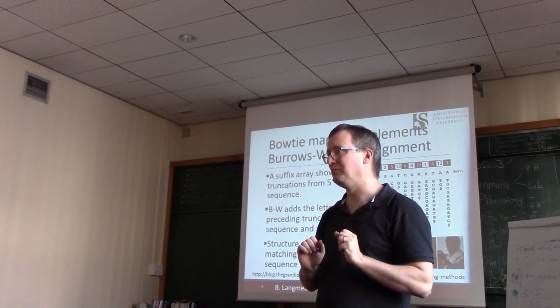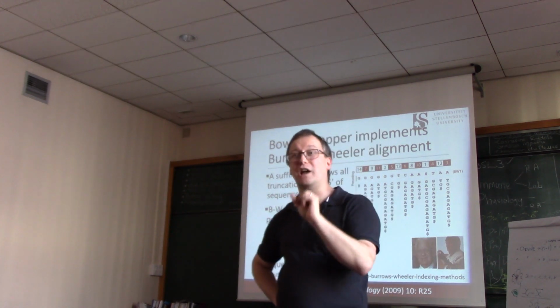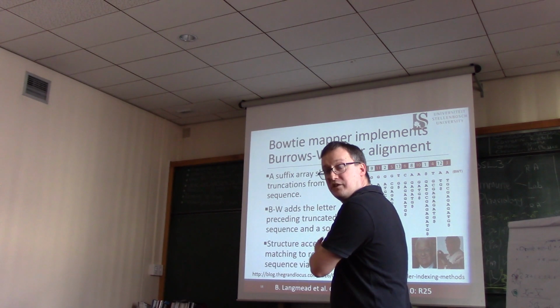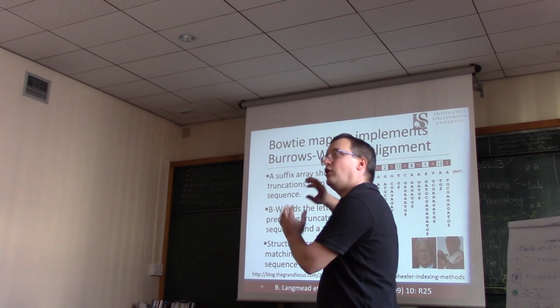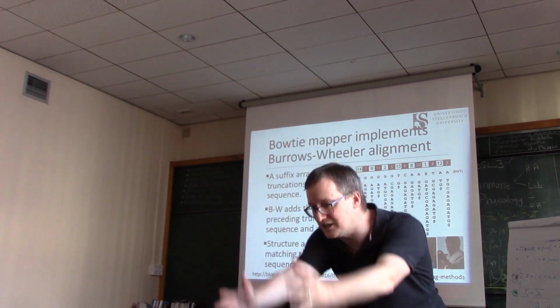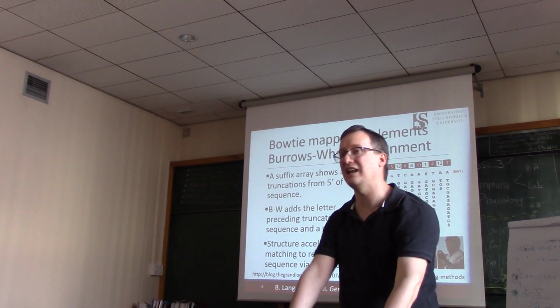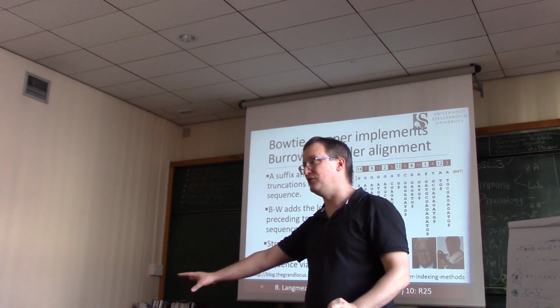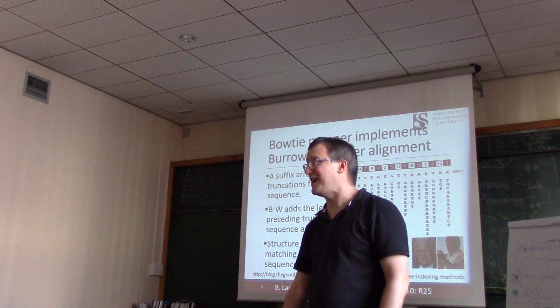But wouldn't it be a whole lot cooler if you could build one data structure, the suffix array, that incorporates all of the reads, and then pass that data structure through the annotation once, and get out where each of those sequences hits on any of the genome annotation? That's magic.